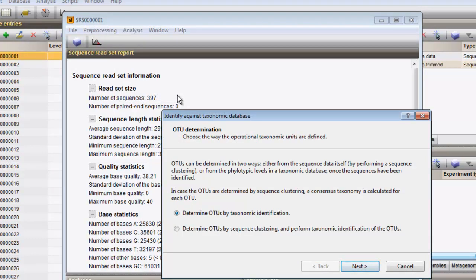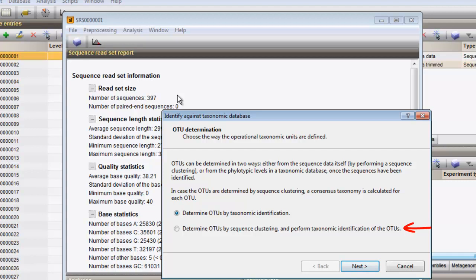The first question asked is which way operational taxonomic units should be defined. The first option will identify the sequences against the reference taxonomy and create OTUs from the obtained taxonomic identification results. By choosing the second option, distances between unique reads are calculated and based on the calculated distance matrix, a cluster analysis is created. For each cluster, the sequences are identified against a reference taxonomy and OTU assignments of the clusters are based on the taxonomic identification results.